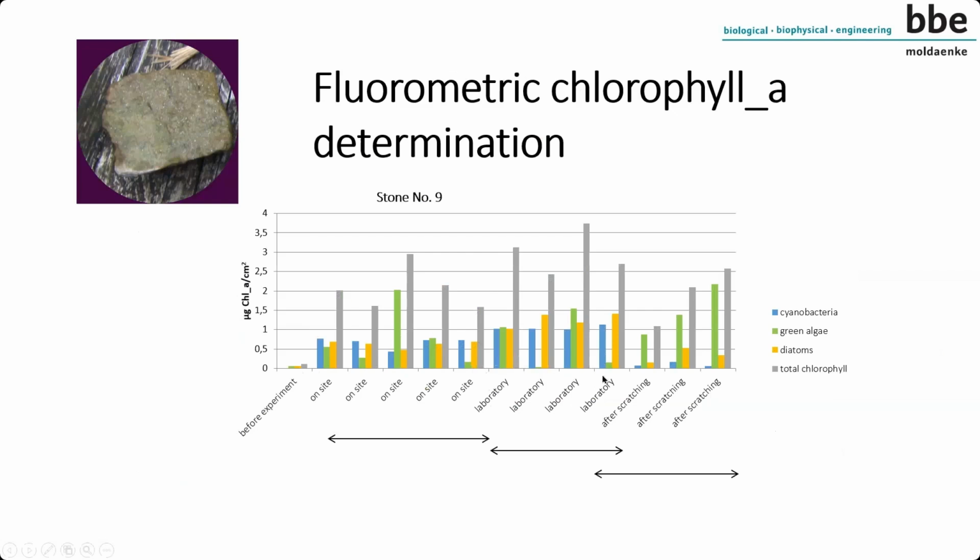And after scraping, we still see on the stones, in some caves, algae shown with the BenthoTorch, which reflects that we could not scrape everything from the surface. That means this is an example where scraping cannot extract all the algae and show that it is really representative.